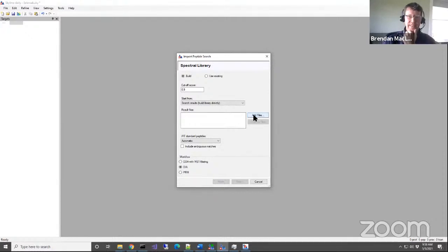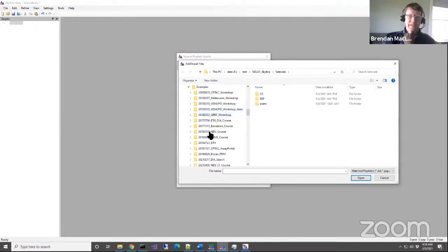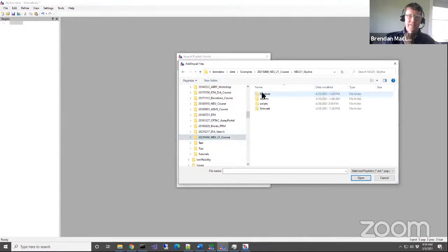And at this point, I'm not even sure I have those files on this machine. I guess I could go, you don't have the files. We're not going to be able to build this right now. But I guess I have them down here in examples. I have it in here. No, not really.